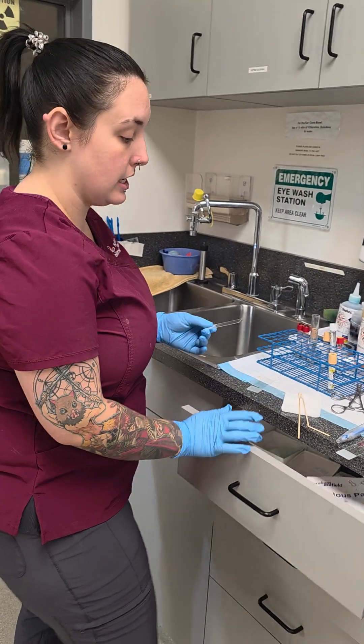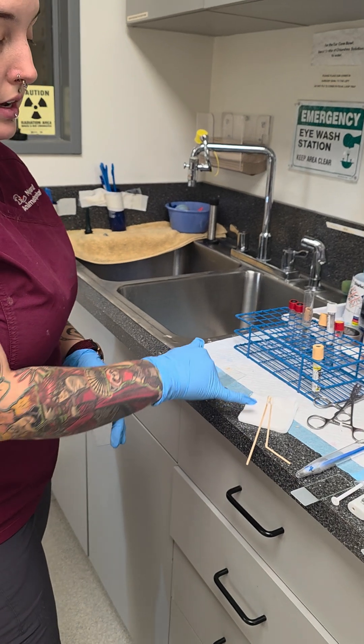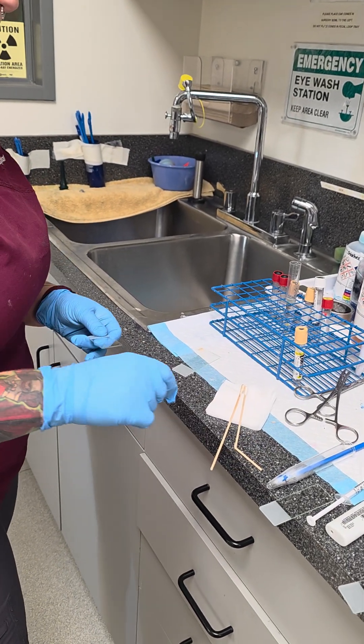All right, so here we're making an ear cytology. I already have my samples. Right ear is straight, the left ear is broken.